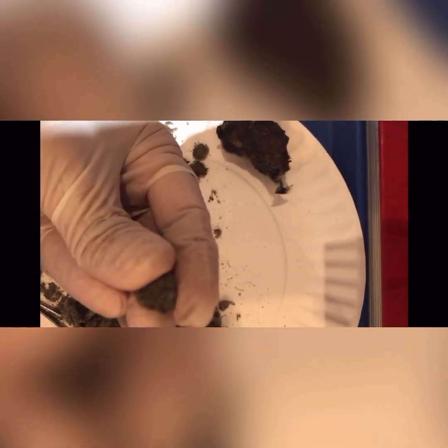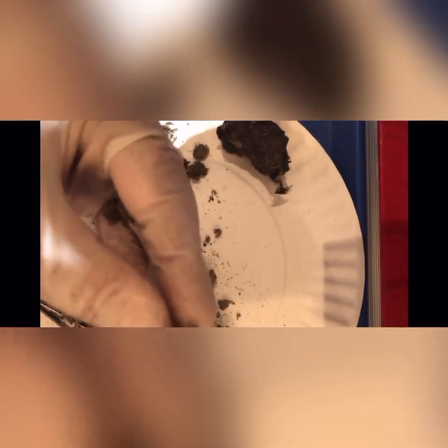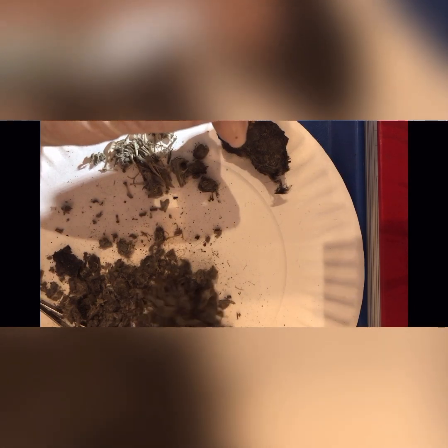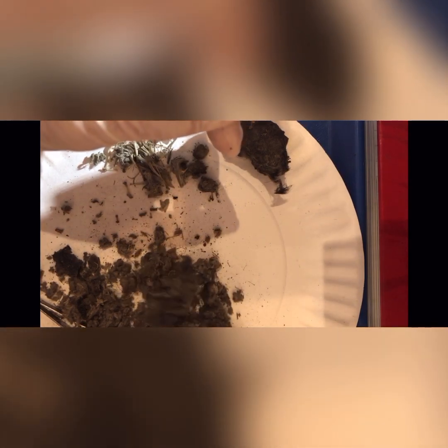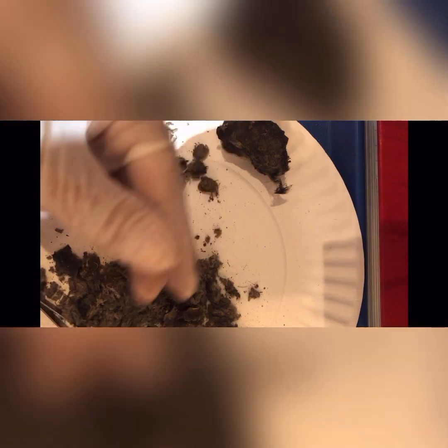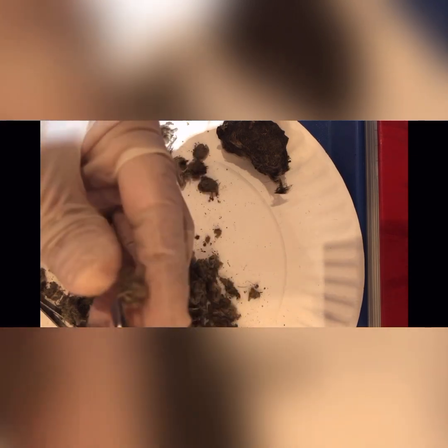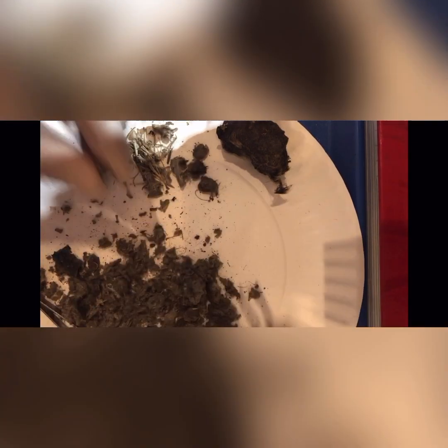If we found feathers, then I would think, oh, well, I have some kind of a bird. But I didn't really find the birds. And what I found in past years is the birds are really hard to find. They're not very common. Usually in a class of 40, we'll have 1 bird maximum. Actually, even probably less. In a class of 100, we'll find 1 bird.